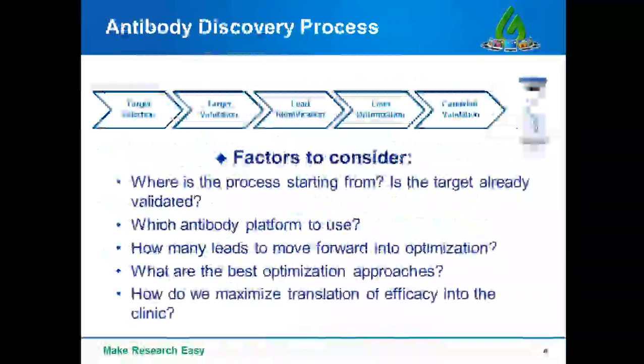For lead identification of therapeutic antibodies, there are a few must-dos to validate a lead. The first is specificity, which can be established by determining their cross-reactivity with human tissue organ sections unrelated to the targets by using radiolabeled antibody or non-radiolabeled with high sensitivity.